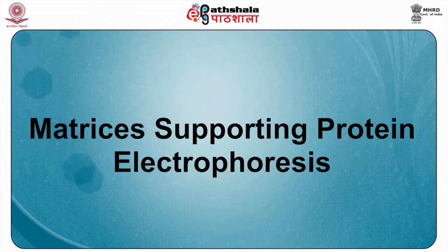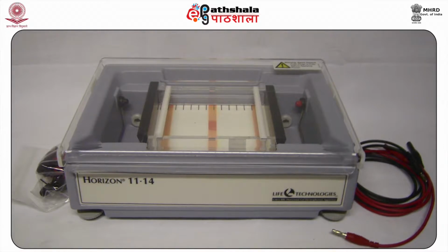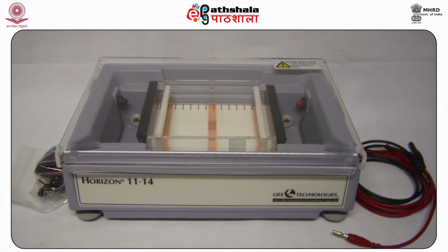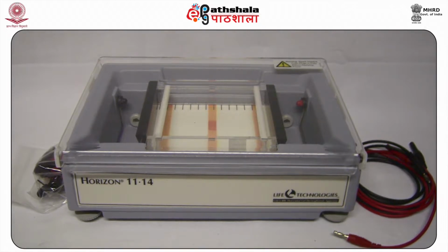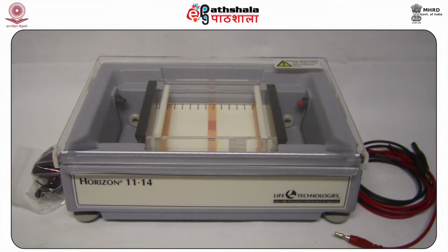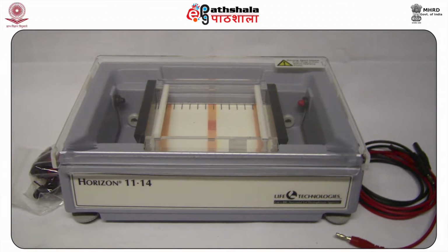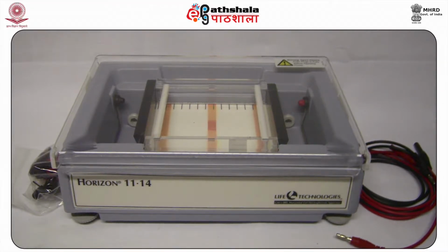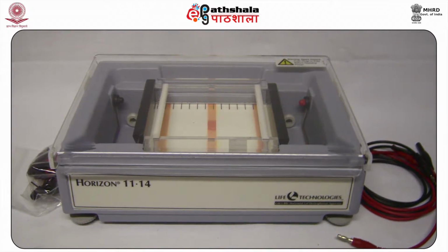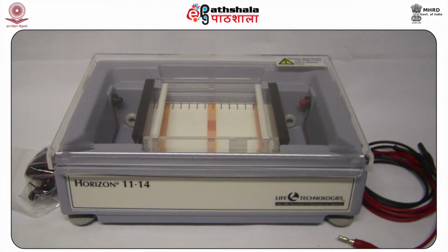Matrices supporting protein electrophoresis. Electrophoresis is carried out in a matrix which serves the purpose of separation of molecules of different sizes. Smaller electrophoretic mobility is seen in molecules of large size. Basically, two types of matrices are used for protein profiling in forensics. These are papers such as cellulose acetate, or gels like agarose or polyacrylamide.